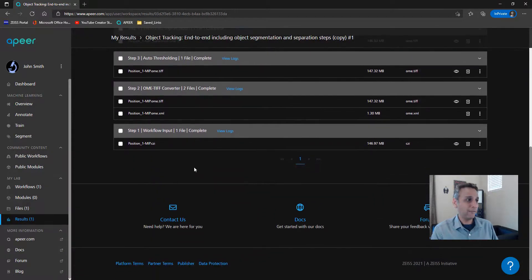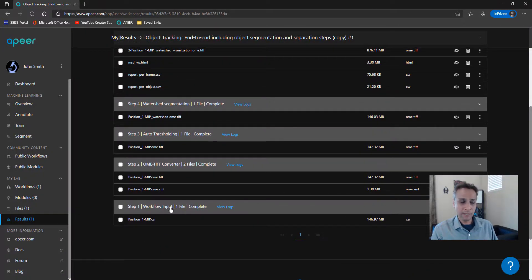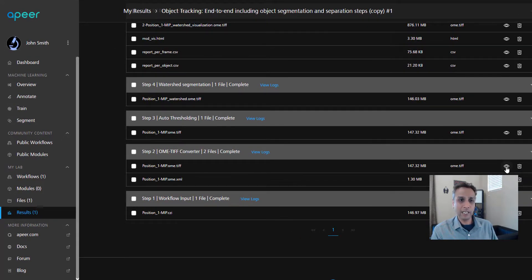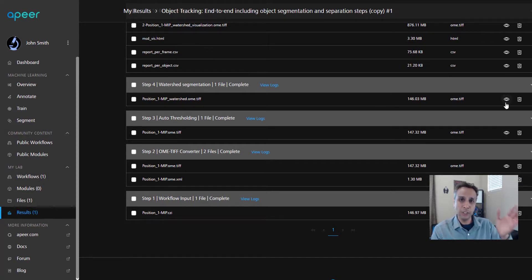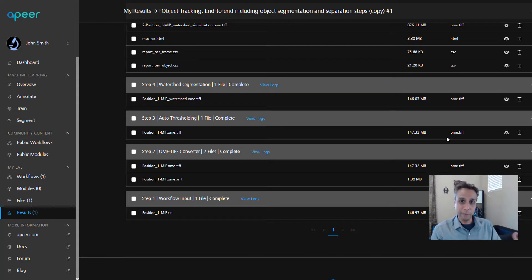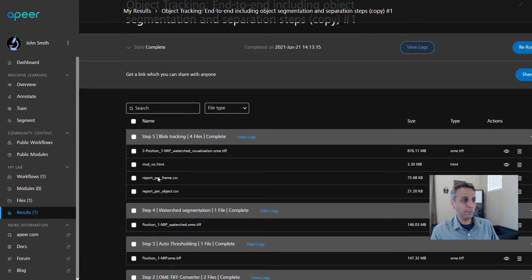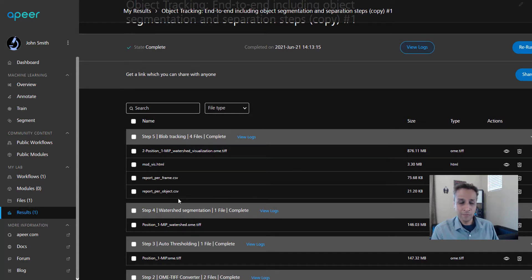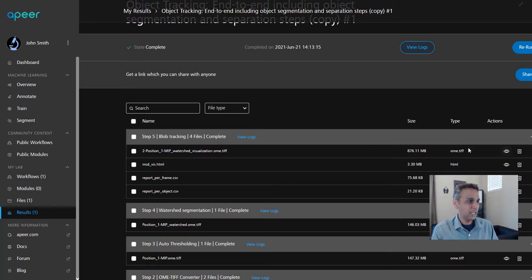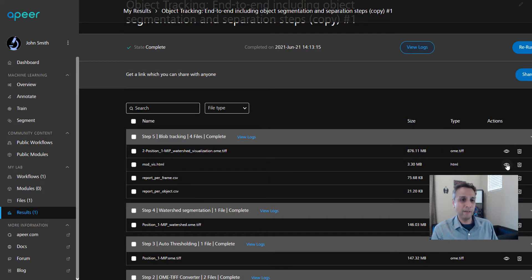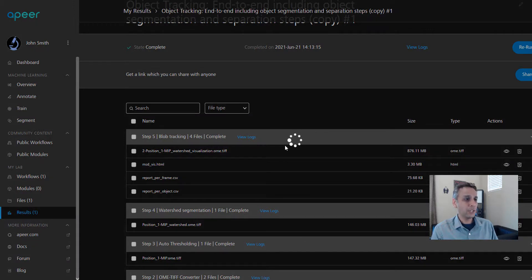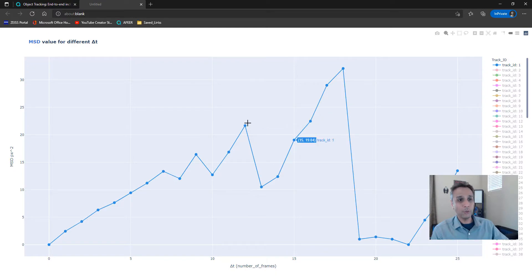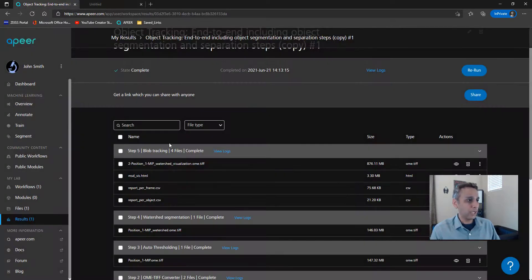What do we have in this workflow? Module number one is the input. Module number two converts the input into OME TIFF. For each of these images, you have this eye icon. When you click on it, it opens that in a new browser window where you can browse through your images. Step number three performed our OTSU thresholding and then watershed. Finally, that acted as input to our blob tracking module. These are the results for tracking. Here it has the watershed visualization. You can click on this and visualize your image after watershed segmentation. Here you have an HTML file.